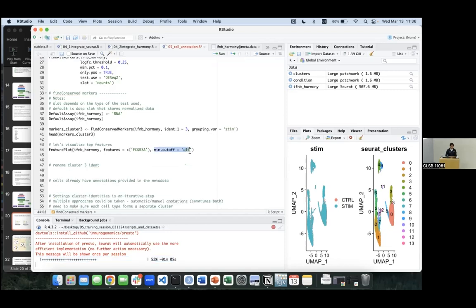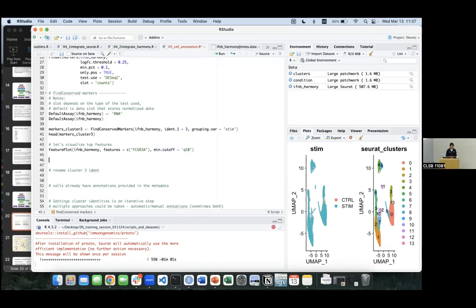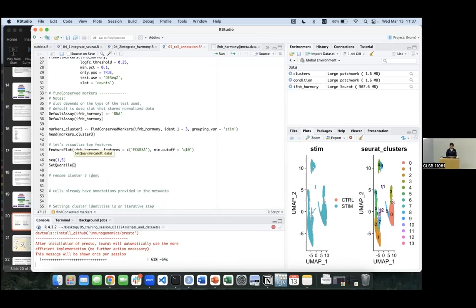Yeah, so just to quickly explain what quantile means. Say you have the sequence 1 to 5, and then you can set quantile Q50. Q50 of a sequence of 1 to 5 will give you 3, if that makes sense.